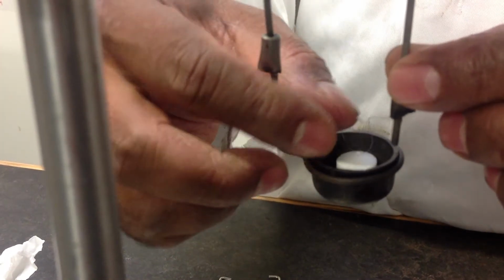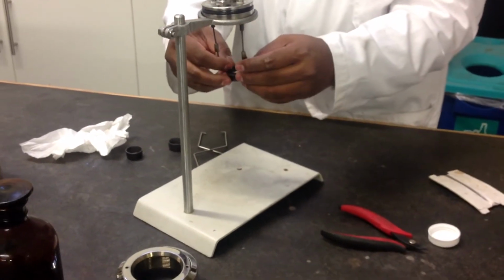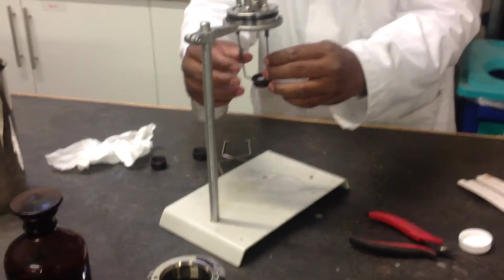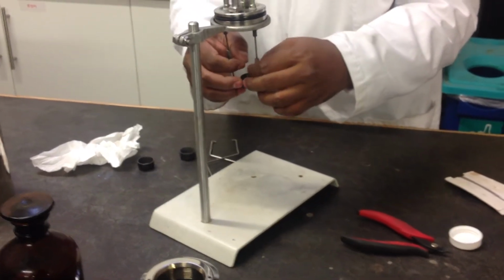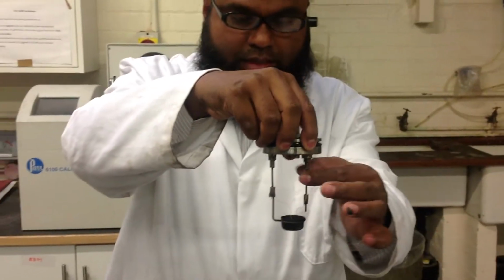Make a U-loop like this. So the fuse wire is not touching the sample or the crucible. This is important.